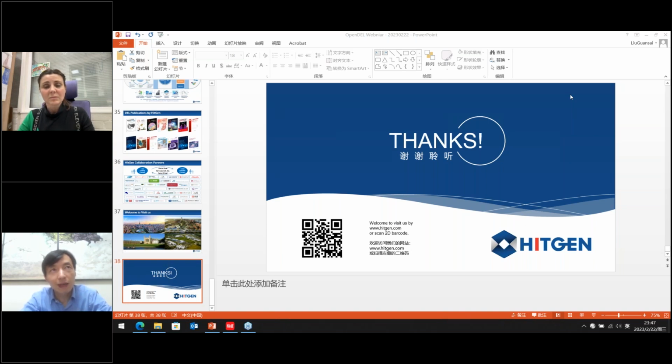The second thing is that after the chemistry is optimized, we use the optimized chemical reaction conditions to validate all of the building blocks that will be used in the library construction. Then we set up a criterion, for example, 50% or 60% yields. Based on these chemical yields, we finally select the building blocks used for the library construction. So this is the chemistry quality control before the library construction.